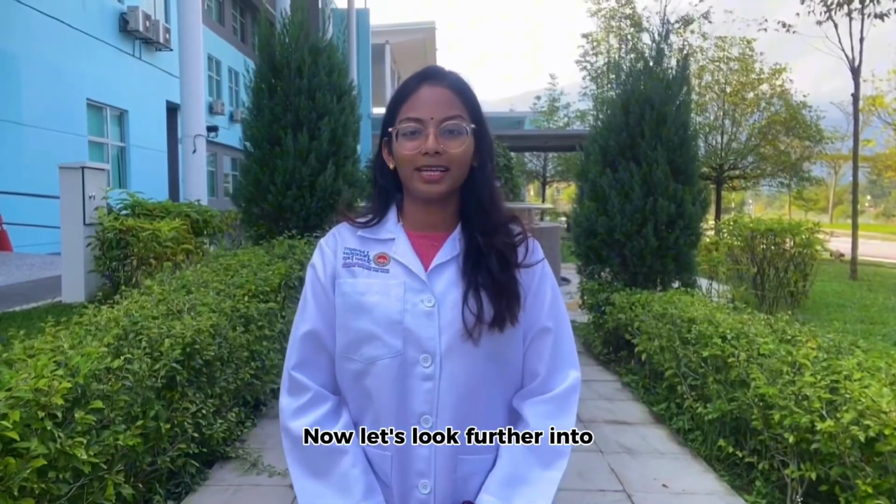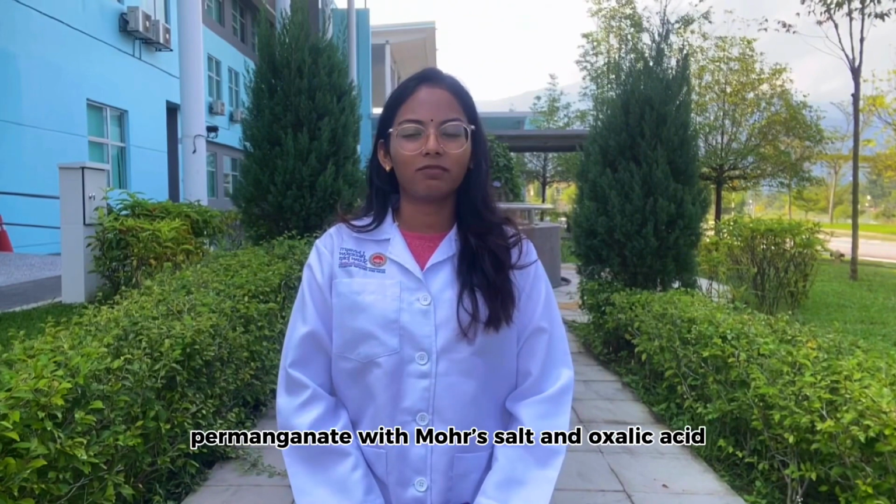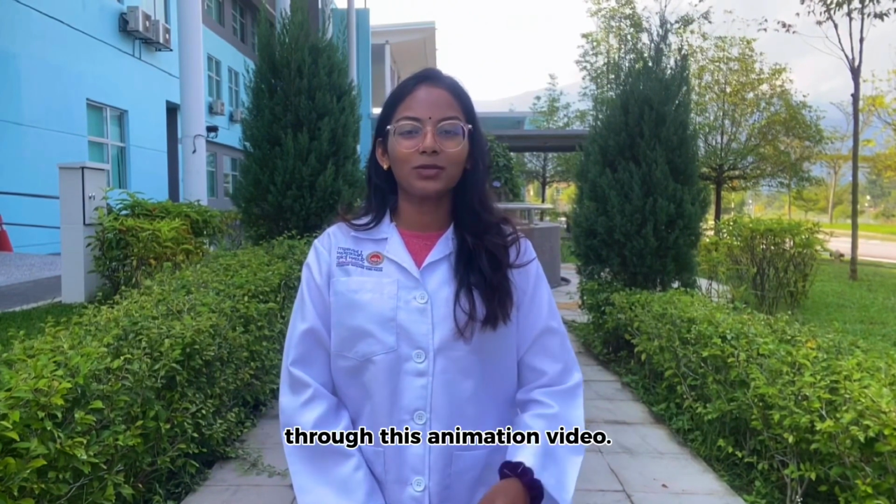Now let's look further into the experiment that we have chosen, which is the titration of potassium permanganate with Mohr's salt and oxalic acid through this animation video.